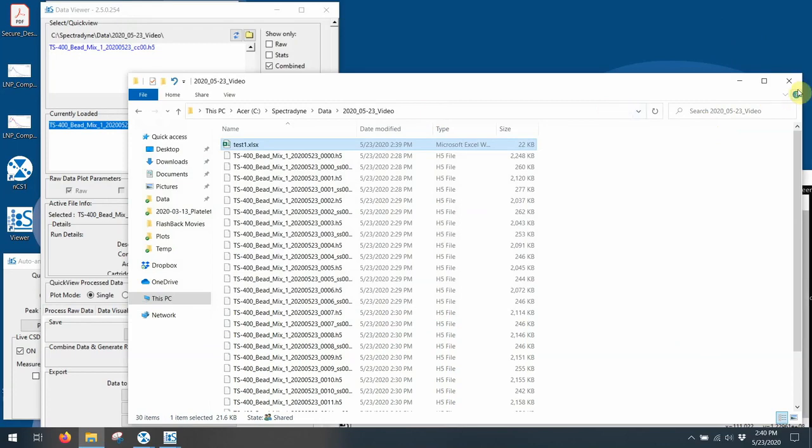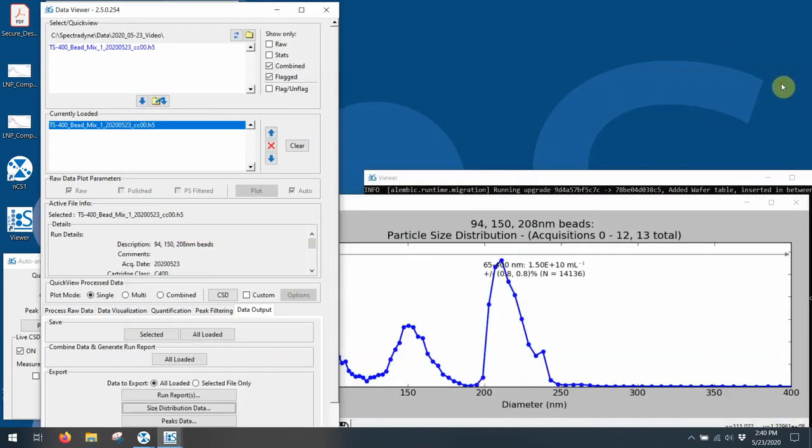The viewer software is very extensive and allows you to do all sorts of data manipulation and data output for presentation. But it is beyond the scope of this particular video.